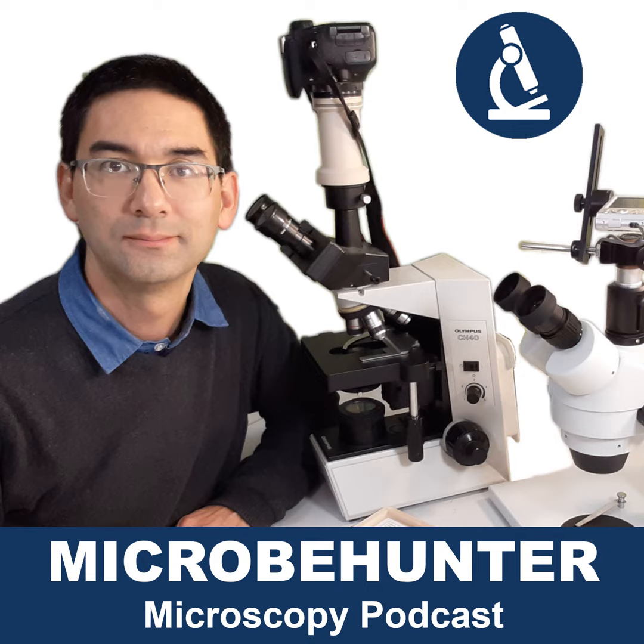This requires a certain skill and knowledge, also in sample preparation. Sooner or later, everyone's pretty much going to go into specimen preparation, unless you want to observe ready-made slides, which is also fine. If you just want to do some natural observation, sooner or later everyone's going to do some specimen preparation. But there are some folks who are taking the whole thing a step further, and they're making permanent slides which really can last for a very long time, and they require quite an extensive and elaborate specimen preparation.